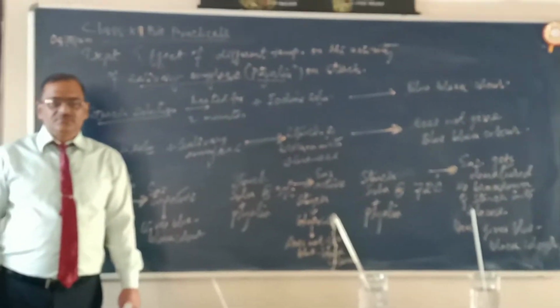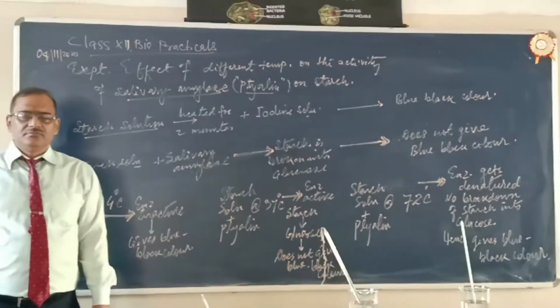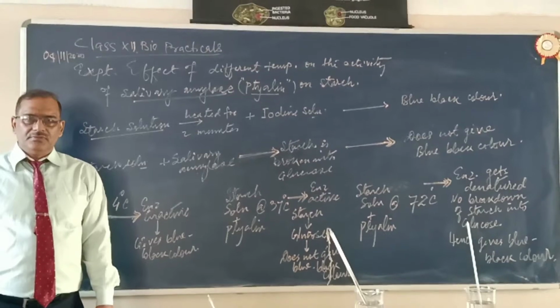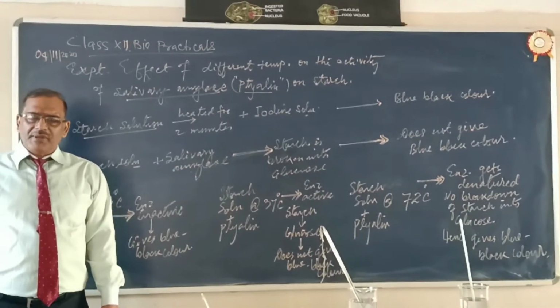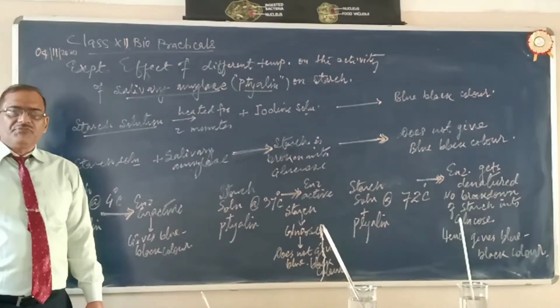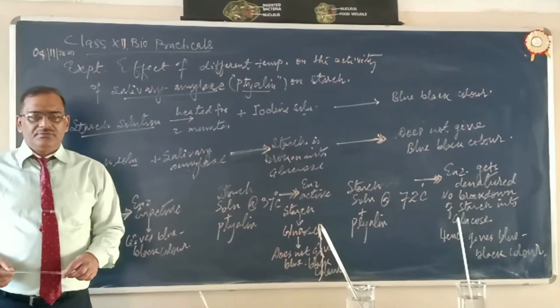Good morning, students. This is biopractical class 12, subject biology. So today we are going to discuss the practical or experiment: effect of different temperature on the activity of salivary amylase.